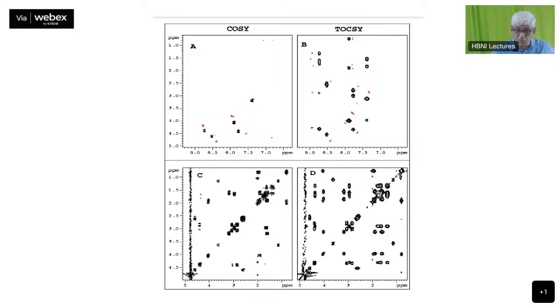So here you have two beta protons here, and these chemical shifts are in the 2.5 to 3.5 area, and you may think that okay, this may belong to kind of an aromatic residue, phenylalanine or tryptophan or things like that. And this fellow shows one here and then two and a few there. So this again is a long side chain. This is at the 3 chemical shift, and this means that it is something like a lysine. The lysine epsilon proton is there. The lysine epsilon may be coming here, and these are the betas and the gammas, so which are going in that manner. So therefore, these chemical shifts will kind of indicate to you what sort of amino acids there may be present in your molecule.